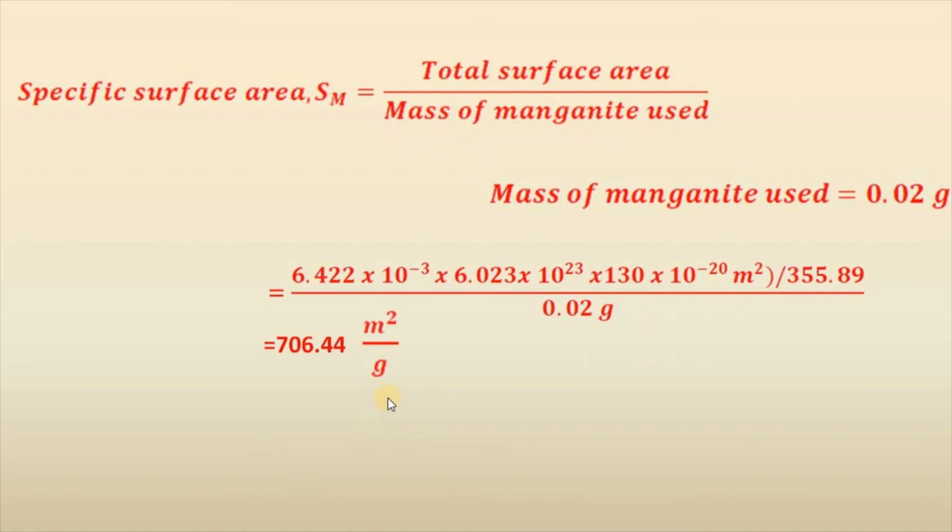This is how we can easily calculate a specific surface area of bed or surface using methylene blue dye adsorption method.